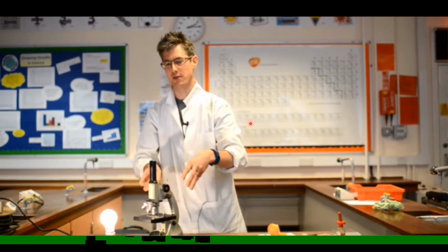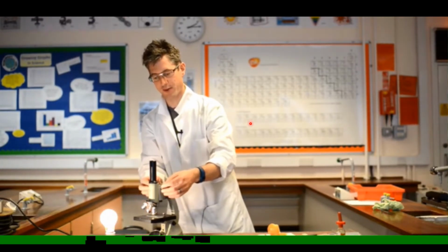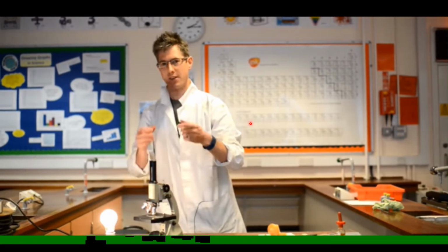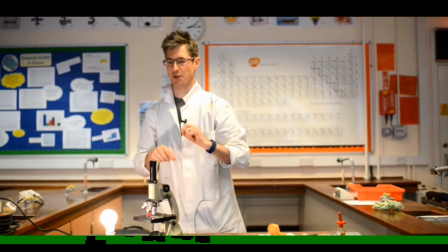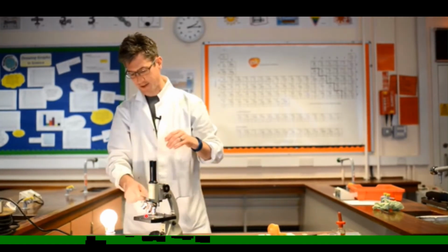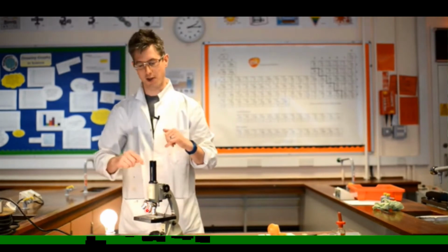And when you need to use the high power, you should be more careful because it is a lengthy knob. මෙතන high power එක use කරනකොට ටිකක් පරිස්සම් වෙන්න ඕනේ. හේතුව මේ high power lens එක සම්බන්ධ කරලා තියෙන knob එක ටිකක් දිගයි.